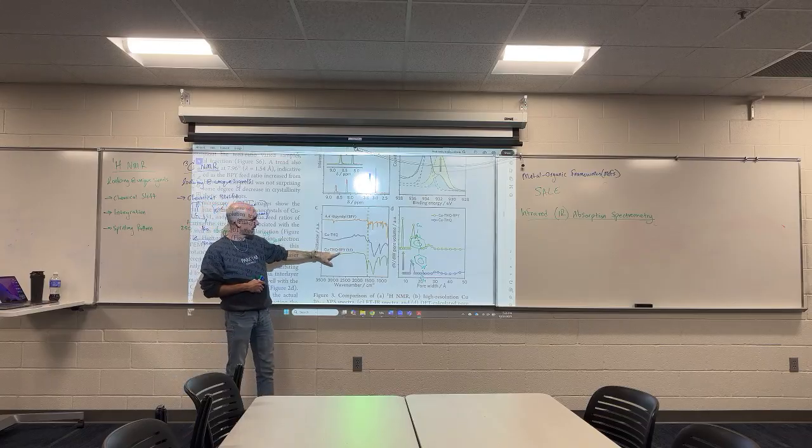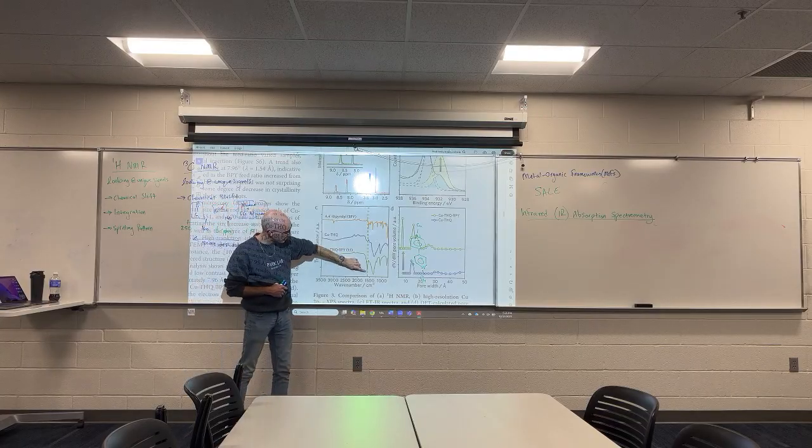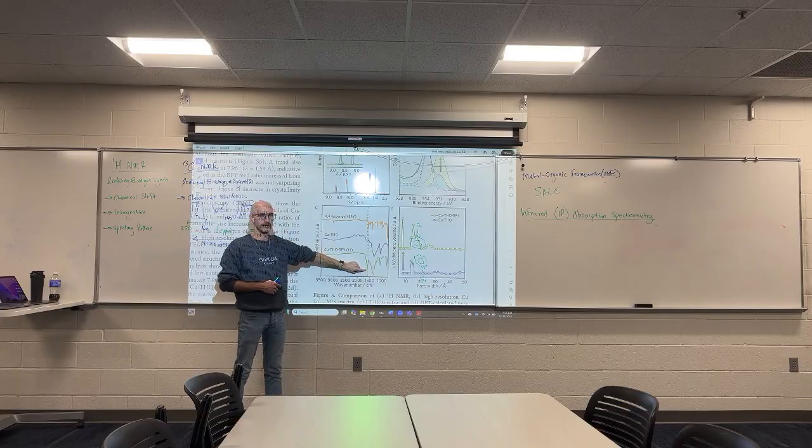So to prove that I had actually inserted it into my material, I noticed that the signal shifted. By a lot? No. But it's not bipy just sitting in my copper THQ.